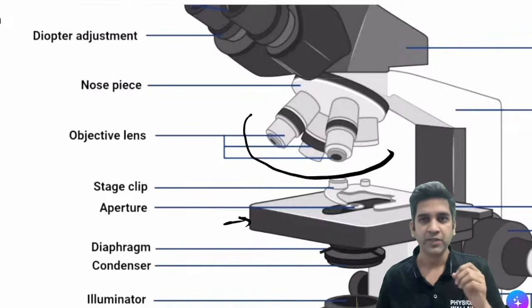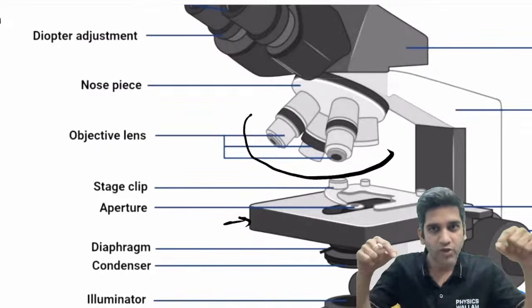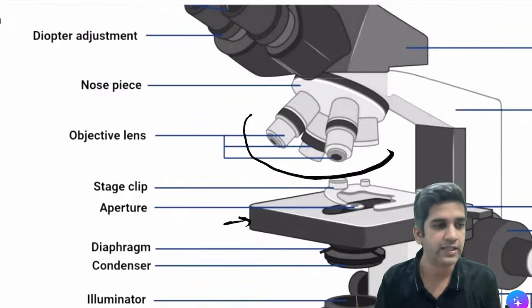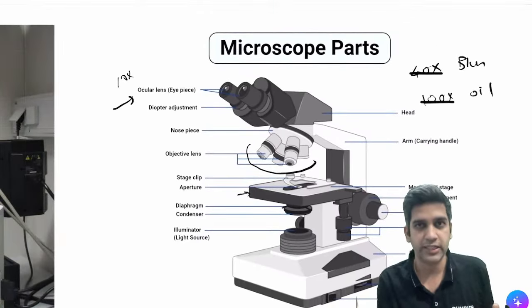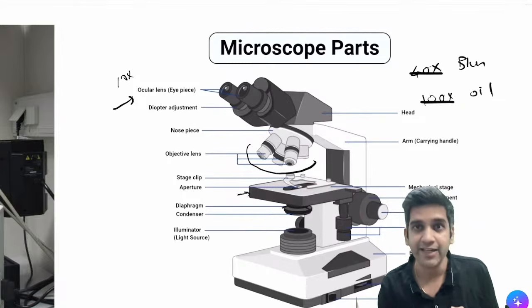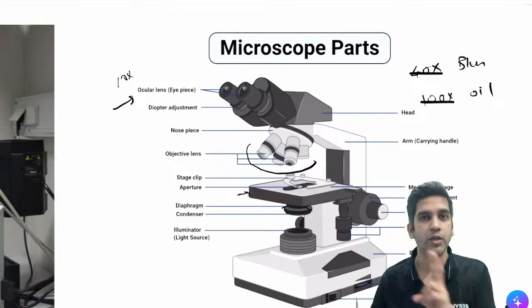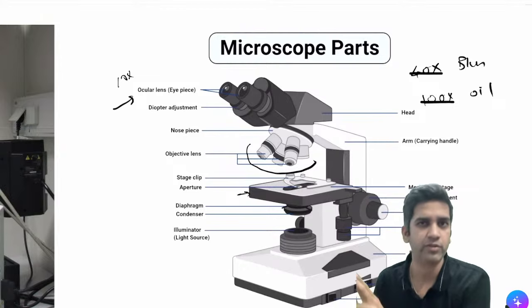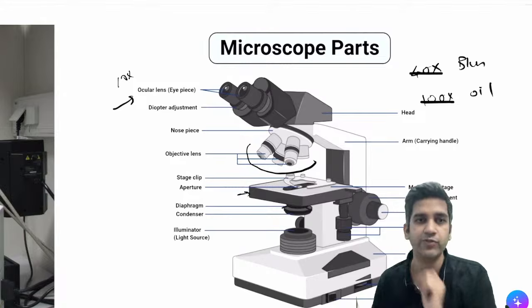I also asked you guys, did you go and have a look in the practical lab? Did you see the microscope? Were there lines there? Were there markings there? That's helpful for markings as well, right? Perfect. So this is what we saw in the last class. Also, it will be written there, and there are also lines. Both are useful. It will be written 10x, 20x, 40x, 100x, and 4x for the scanner, and there will also be a color for each, right?